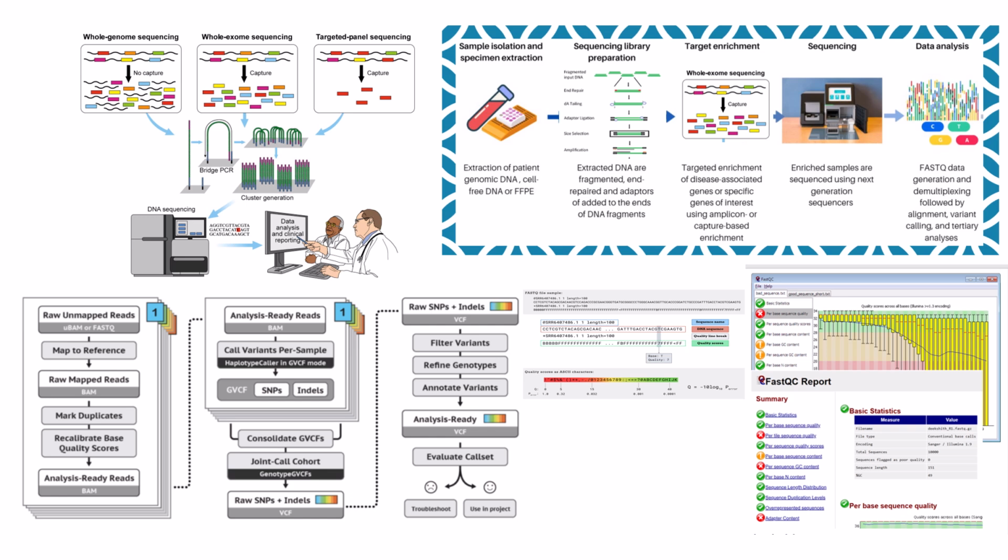Millions, sometimes billions, of these short DNA fragments from the patient are aligned, meaning they're precisely mapped back to their correct location on that human reference genome, HG38. So finding the address for every single piece. Pretty much. Tools like BWA-MEM are workhorses for this. The main output is what's called a BAM file. It's a highly organized, standard digital format that represents the patient's sequenced genome, showing where every single read lined up on the map. Like laying out all your jigsaw puzzle pieces correctly on the picture on the box lid? That's a great way to think about it.